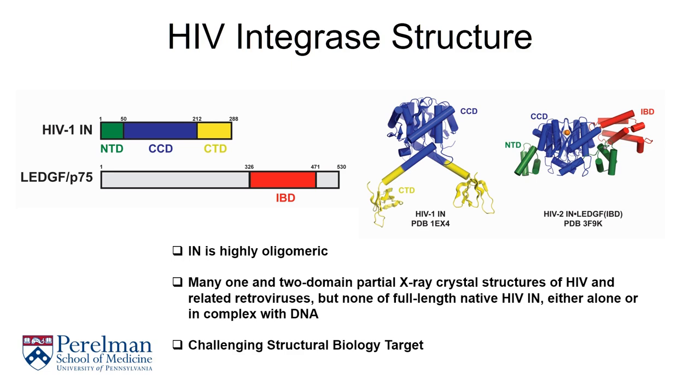The most distinguishing feature of the recombinant HIV integrase protein is its propensity to self-associate and form oligomers, with everything from monomer to dimer and tetramer to even octamer having been reported based on a variety of techniques and a broad variety of experimental conditions.